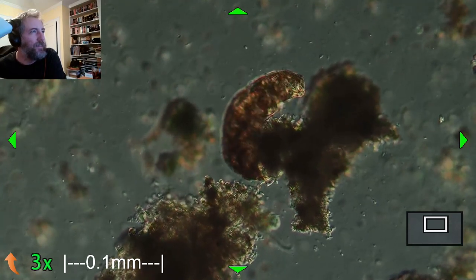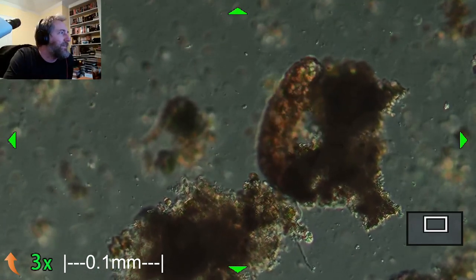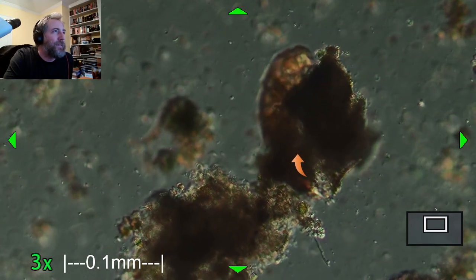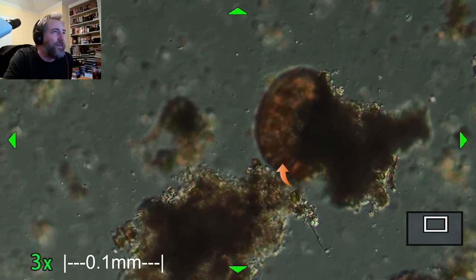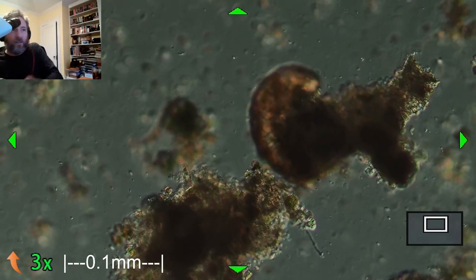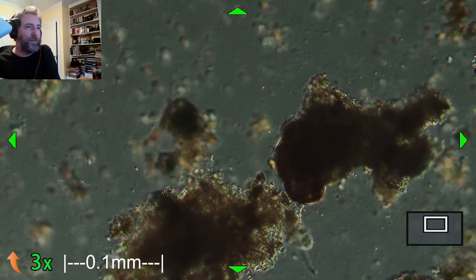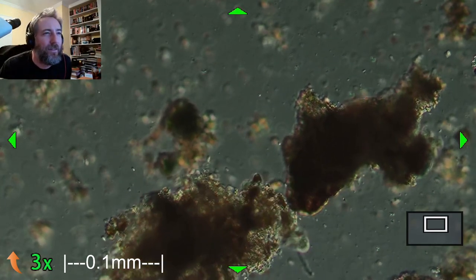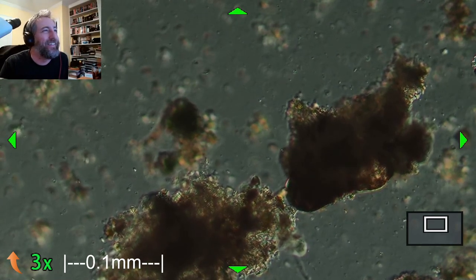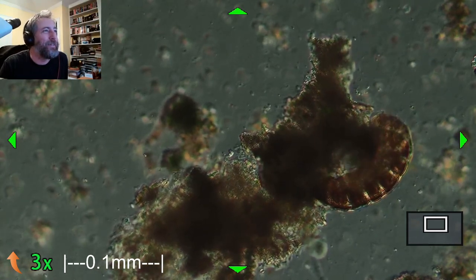Yeah, you can kind of see it's got its back legs grasping and its front legs are sort of digging around. Here's the back legs, and then its front legs are basically climbing. You can see they're kind of hooked. Its body's sort of shaped like a scallop in a way. It's hard to keep it in focus because it keeps fumbling around on this big particle. Yeah, he's having a wrestling match with lunch. Yeah, it could be.